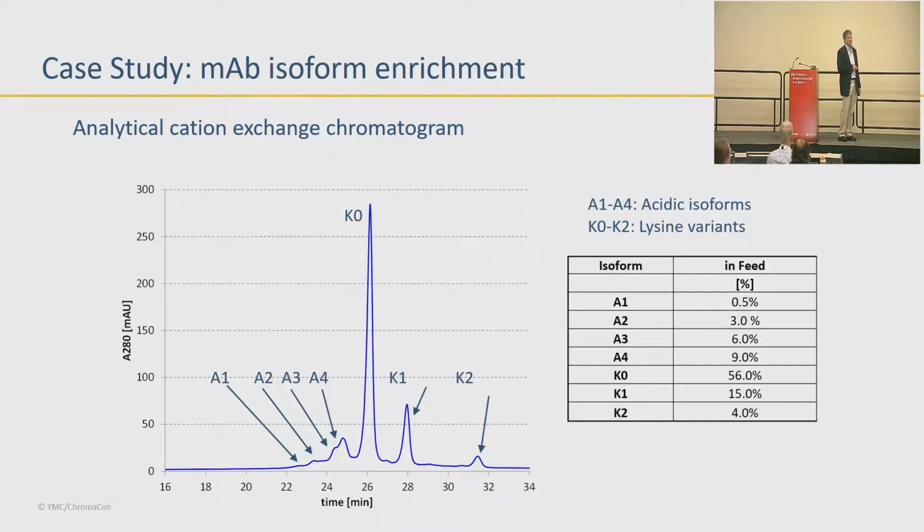sample in order to have enough material to isolate these, because now this isn't just for identification. They actually want isolated material that they could use as standards for the future. So they wanted to obtain enough material that they could retain it for their QC labs to have as marker mixes as they proceeded down their development road.